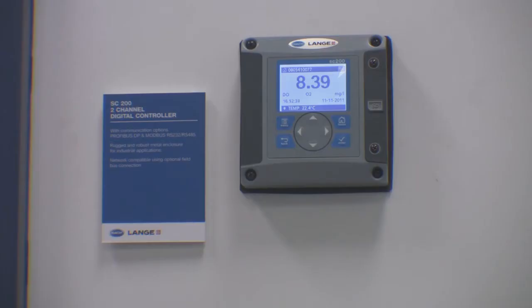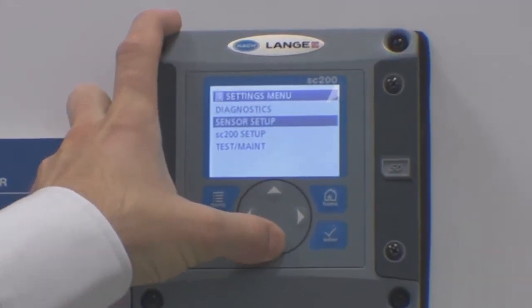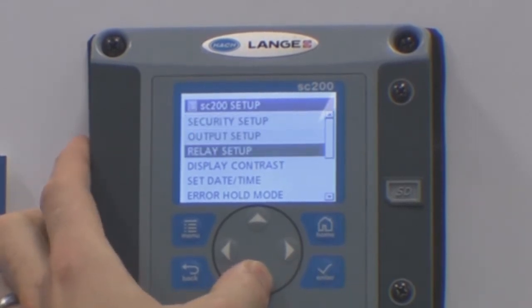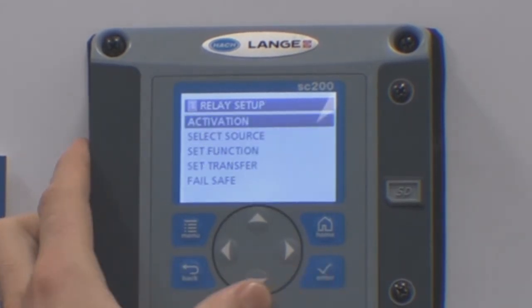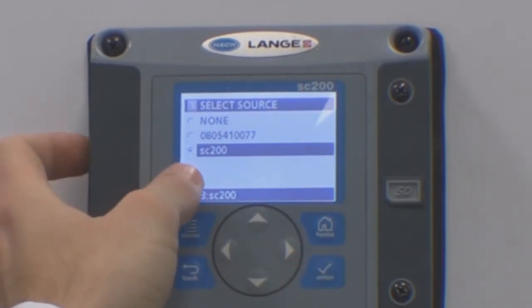Here is how to set up the cleaning cycle. Press the menu button and select SC200 setup. Now select relay setup. Select the relay that is connected to your air blast system. Firstly, select the source — this will need to be your controller.